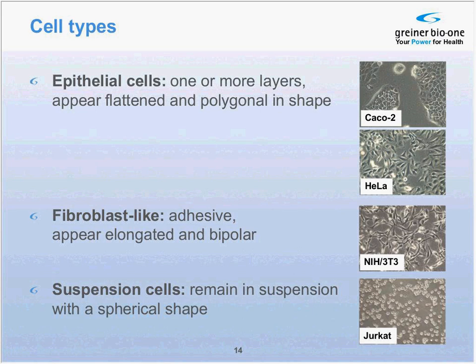Epithelial cells have a polygonal shape, and their appearance can vary from non-confluent island-like structures, shown here for the Caco-2 cells, which is a colon carcinoma cell line, to more or less equal growth, such as with the HeLa cells, which are derived from a cervix carcinoma. Cells of the connective tissue, such as fibroblasts, appear more elongated than epithelial cells. Note the different morphology of mouse embryonic fibroblasts, NIH3T3, compared to the Caco-2 or the HeLa cells.